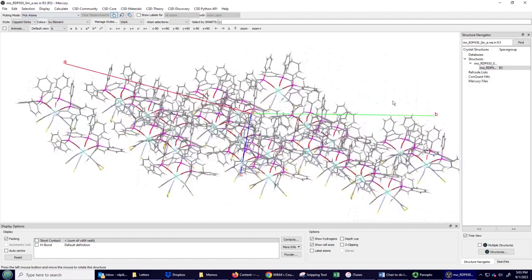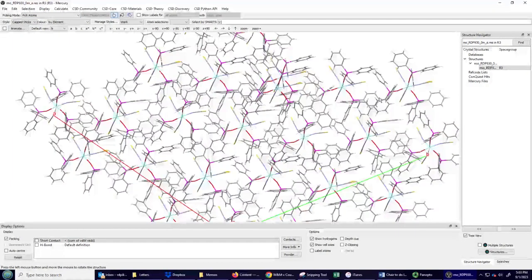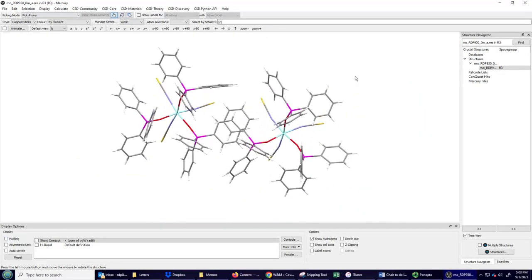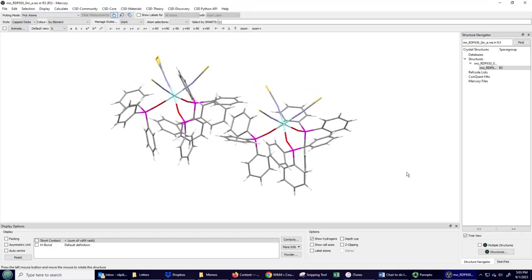And you can still see that the unit cell is pretty complicated, but the unit cell has lots of symmetry operations in it, such as rotation axes and maybe mirror planes and so on. So those symmetry operations allow us to generate one molecule from another. And so if we turn off the packing, we only need these 2 molecules to describe the entire crystal structure.